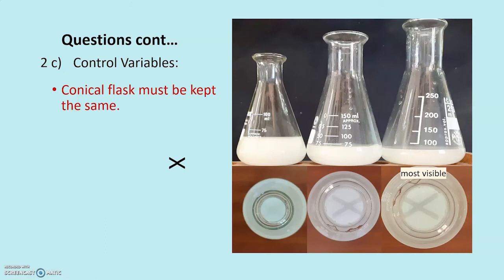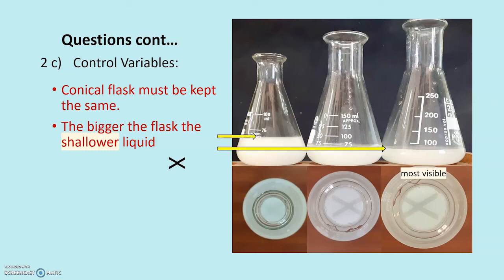The conical flask must be kept the same. The bigger one, as we see over here, would be shallower. Thus causing the cross to be visible for longer. So the shallower one you can see over here, looking at from above, the cross is more visible than the one that is deeper. These two, there wasn't that much difference, but this one is certainly, there's a very faint X over there.